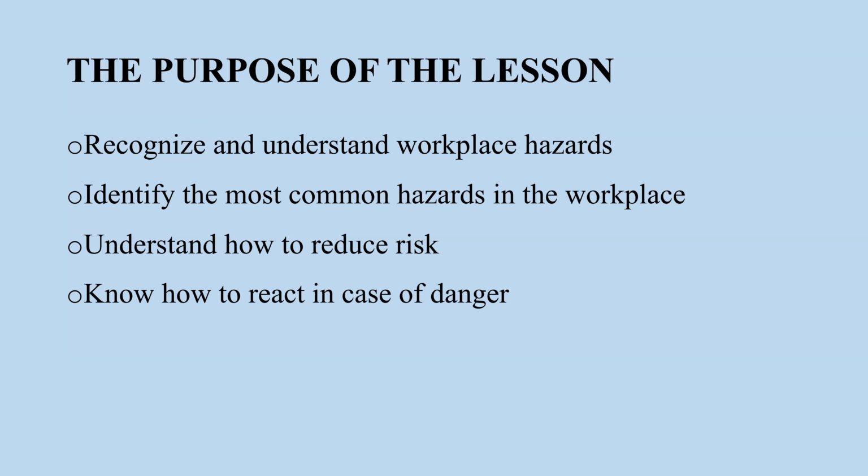The main goal of this lecture is to recognize and understand hazards in lab, identify the most common dangerous things and hazards in the workplace, understand the measures against risks and dangers in the lab, and understand how to react in case of a problem at the workplace.